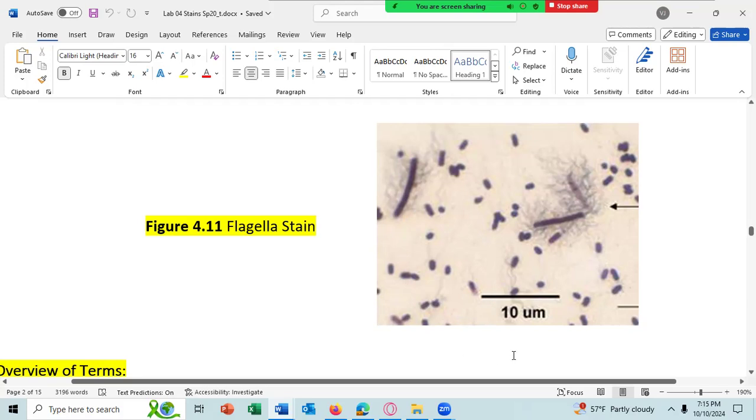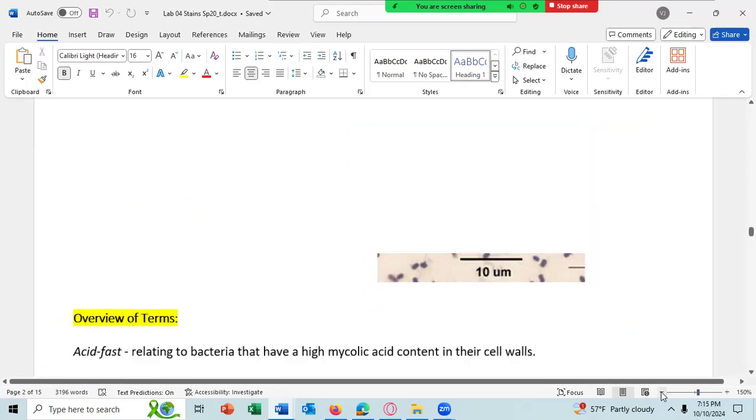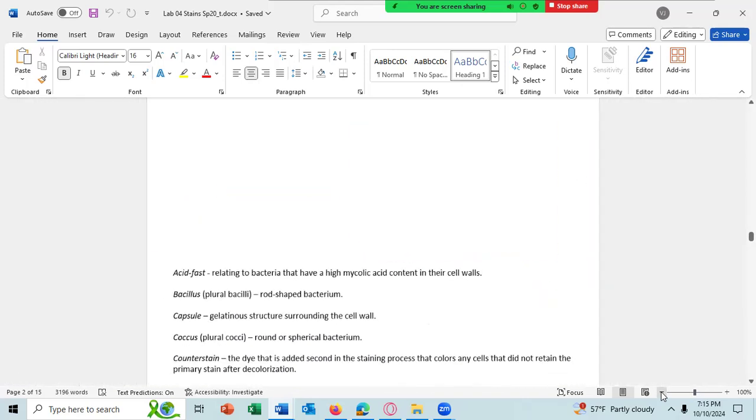What you call this is peritrichous, because it's the highest order flagella arrangement in the slide. And the others will become peritrichous if they're given enough time. Any question about any of that? That one actually looks like it's peritrichous, but just much less than that one. All right, know the terms for this lab?